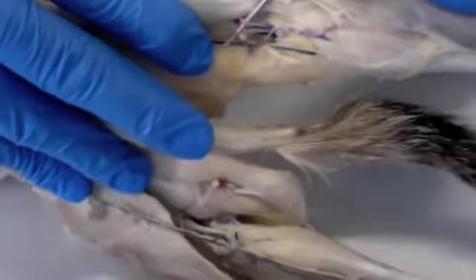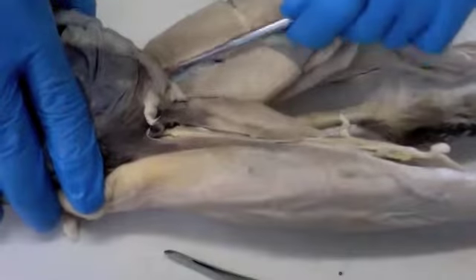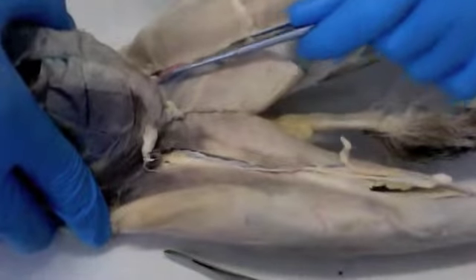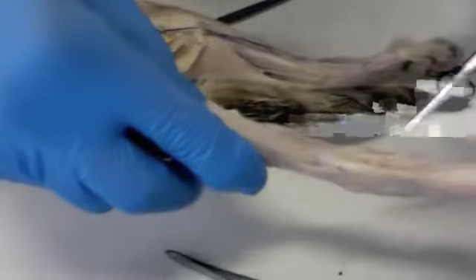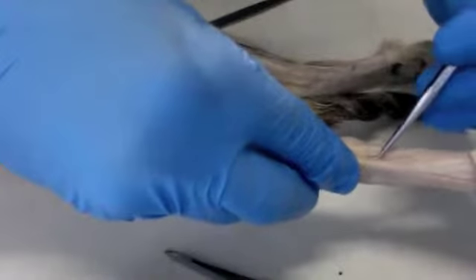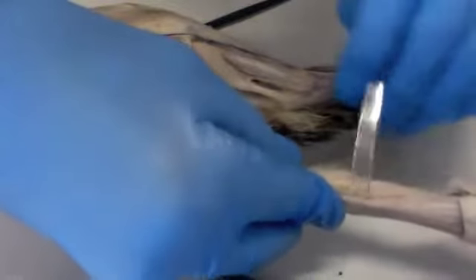Right here. Popliteal artery. And then lower down we have, actually, I'll do the femoral artery first. Here's the femoral artery of the cat's right leg. This is very, very clean right here. You can see it very well. And then of the posterior tibial, right here, I actually tore this tendon in my own foot, the posterior tibial tendon. But this is the artery right here, posterior tibial artery.